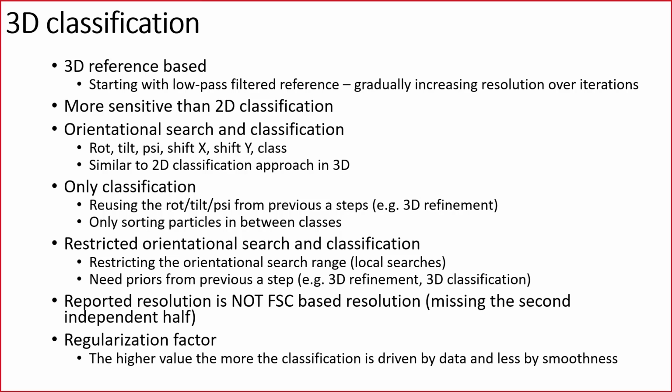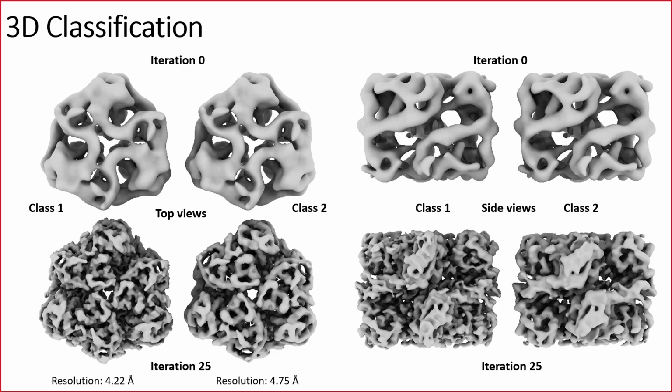Which is not an FSC-based resolution because we don't have halves. So this is a different way to estimate resolution from the signal-to-noise ratio, which is not assumed as a gold standard resolution.